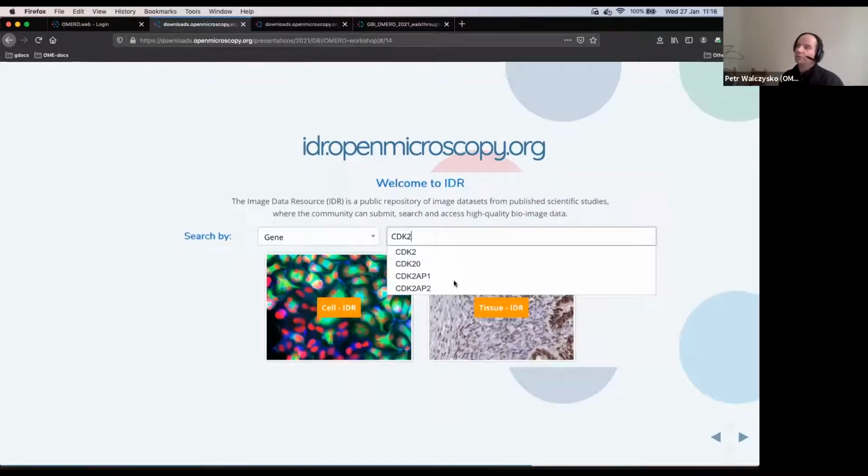Now a little bit of a switch of the topic here. This is Omero in use, and the use is for IDR. IDR will be mentioned tomorrow. Actually, I don't have to go into that too deep, so hold your breath. But the point to take home now is, please remember IDR technically stands for Image Data Resource. We will talk at length tomorrow. Technically, IDR is nothing else than Omero, okay?